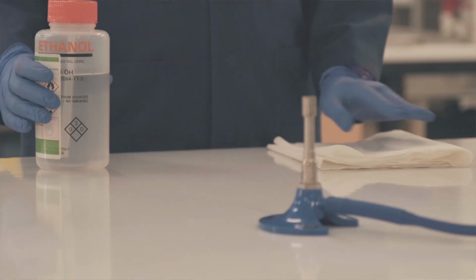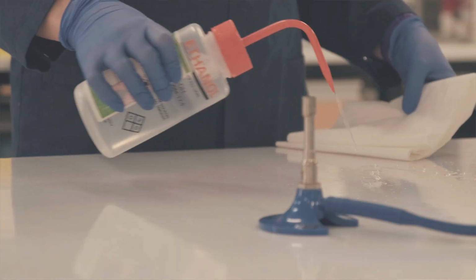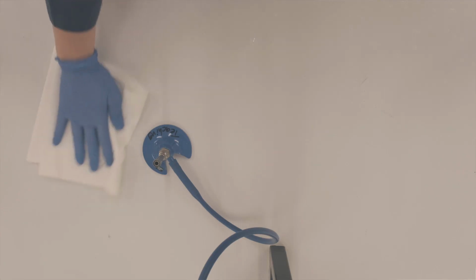Let's start by considering your work area in the lab. Never assume a surface is clean. You cannot know for sure who or what was resting on the bench before you arrived. Always wipe it down with 70% ethanol before and after starting any aseptic work.